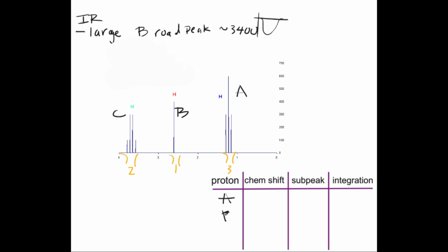For going from NMR spectra to compound, I like to start at the very end of the spectra. Remember, the 1 to 2 ppm region is usually saturated hydrogen environments, which just means alkane-type pieces. These environments are also more upfield due to the fact that they are farther away from electronegative groups. The second peak I'm going to label as environment B, and the third as environment C. I'm labeling the first peak as proton environment A.